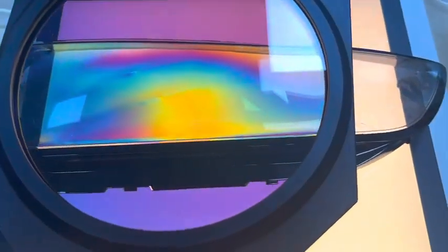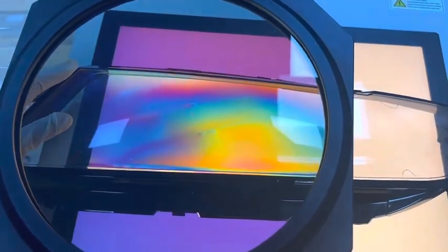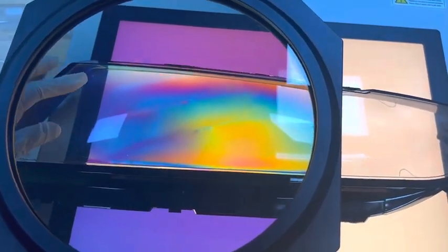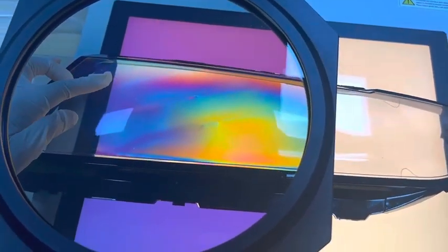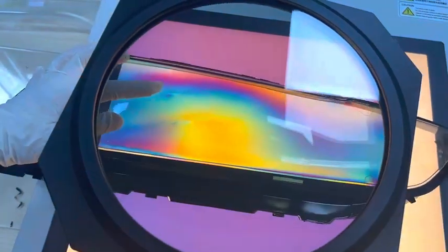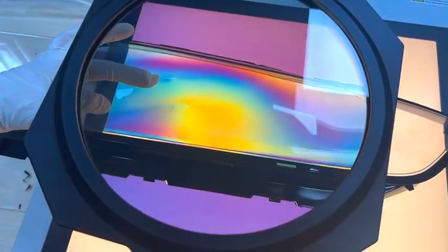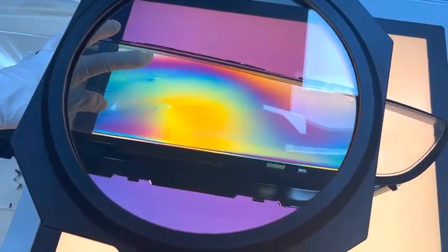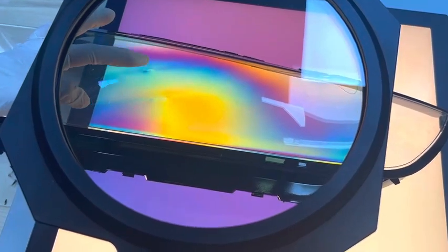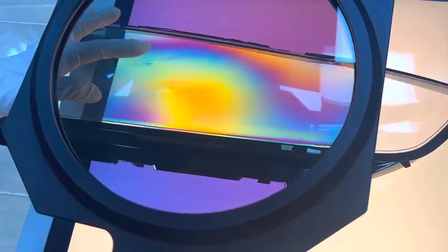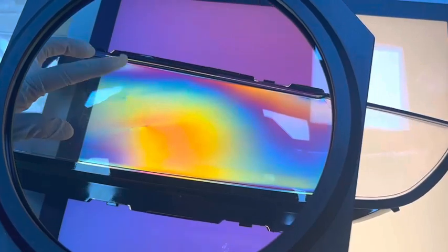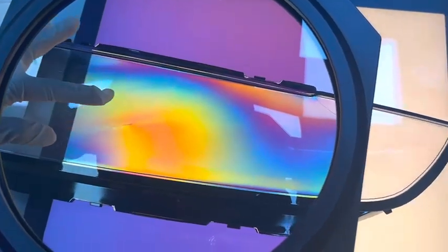You may see some colorful stress patterns. Orange here, blue here. The different colors mean there are different stress levels in these areas.